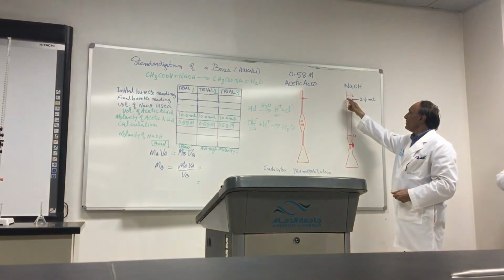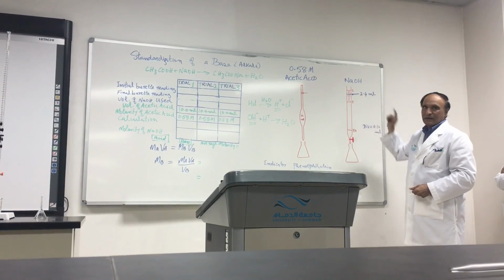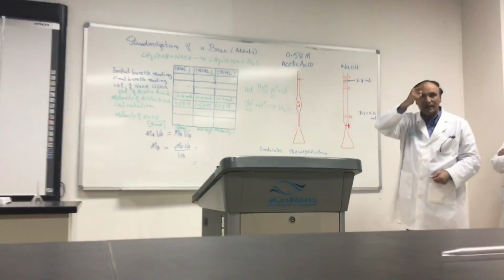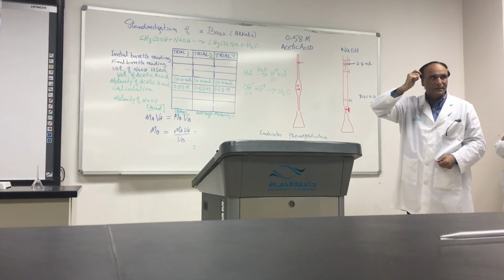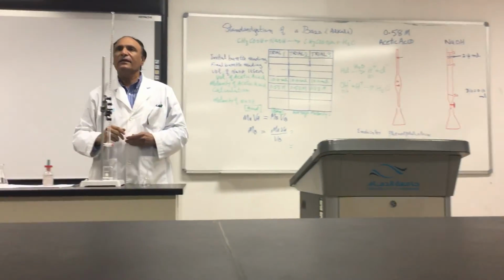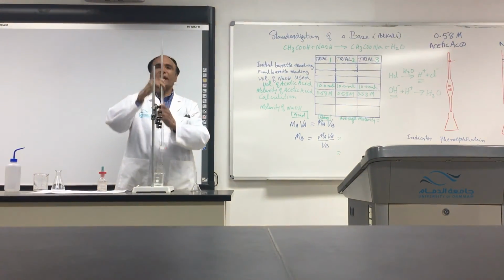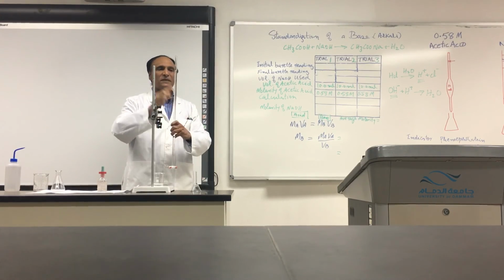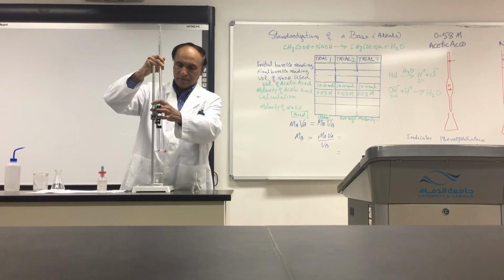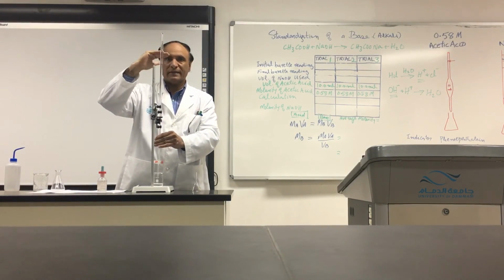Look, if the burette is filled up to here, the lower meniscus, this is 2.4. Did you see that? It's 2.4: 2, then 1, 2, 3, 4. On the 4, it is 2.4, the meniscus. So, when you look at the burette, don't look like that or in that way. It should be just in front of your eye. So you adjust the height like that.